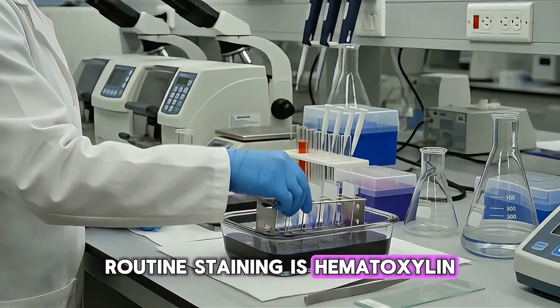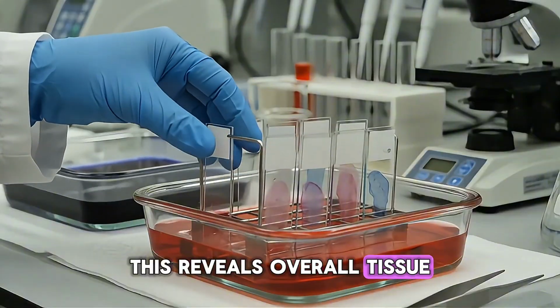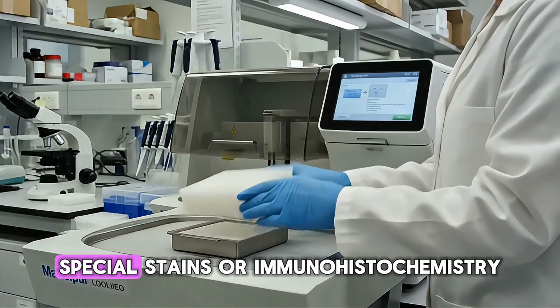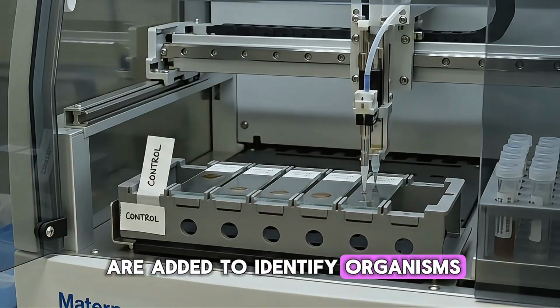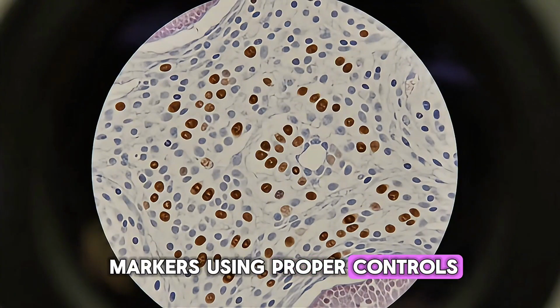Routine staining is hematoxylin and eosin, or H&E. This reveals overall tissue architecture and cellular detail. When needed, special stains or immunohistochemistry are added to identify organisms, tissue components, or tumor markers using proper controls.